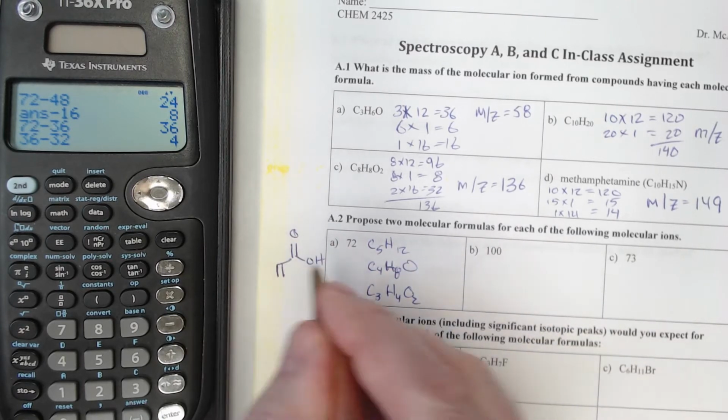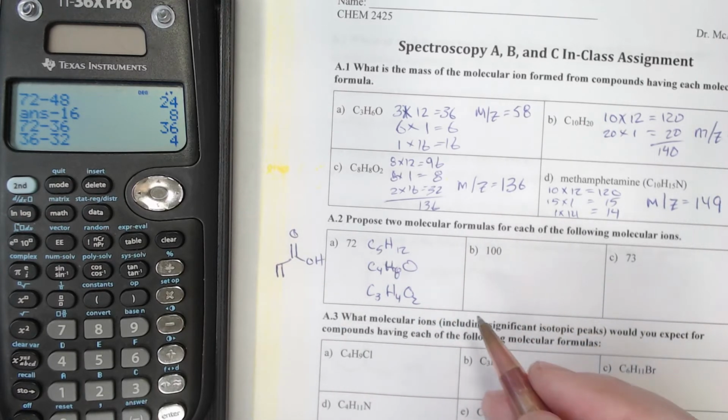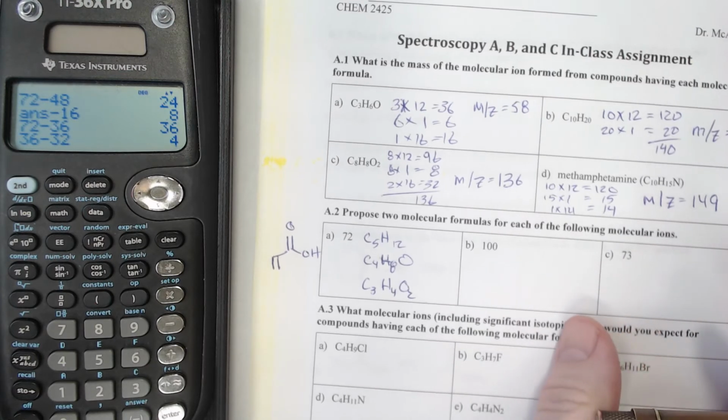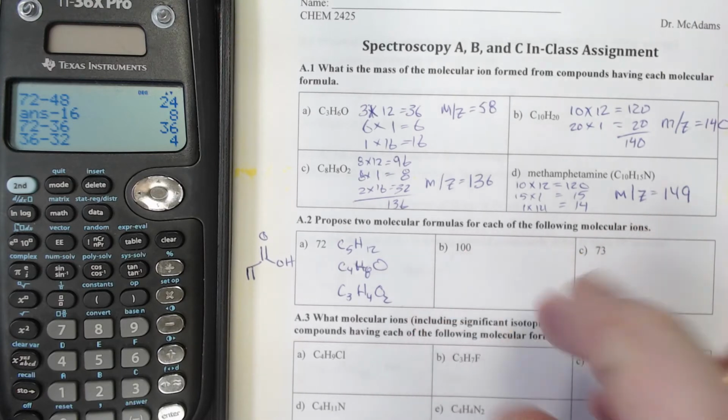So 4 hydrogens, 3 carbons, and 2 oxygens. All right, and this is just called acrylic acid. That is just an example of what that could be. So those are a few possibilities. Let's look at this one.